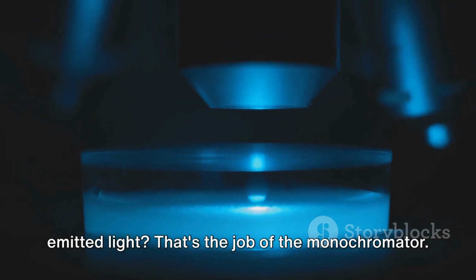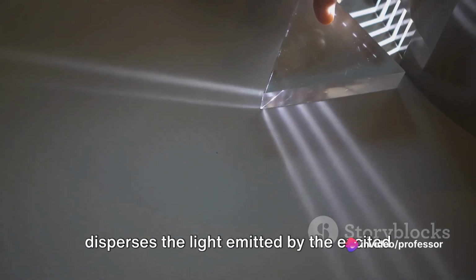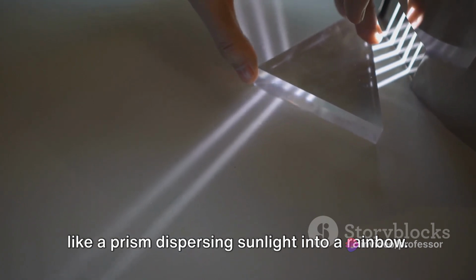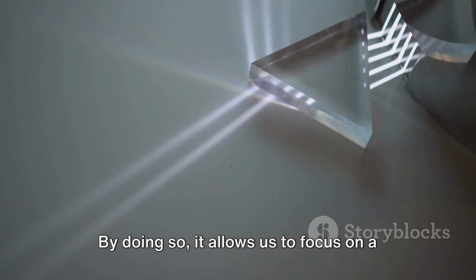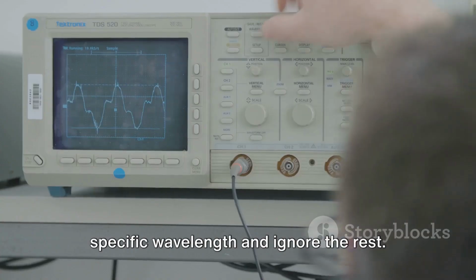That's the job of the monochromator. The monochromator is a device that disperses the light emitted by the excited atoms into its component wavelengths, much like a prism dispersing sunlight into a rainbow. By doing so, it allows us to focus on a specific wavelength and ignore the rest.